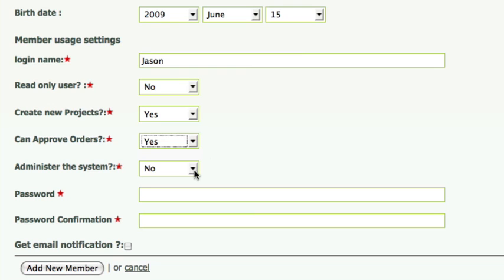Administer the system. I'll keep it no. Only the principal investigator and postdocs at our lab can administrate the system. The administrator is able to add new members as well as change a previous member's status to former. The administrator can also see all documents and projects and has the option to delete an item, even if he isn't the one who added it to the system.